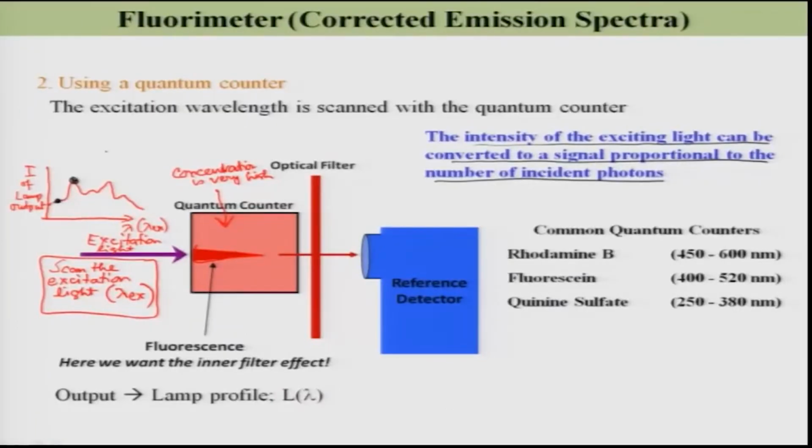of the lamp, as I showed here. So, let us name it L lambda. This is the lamp profile.